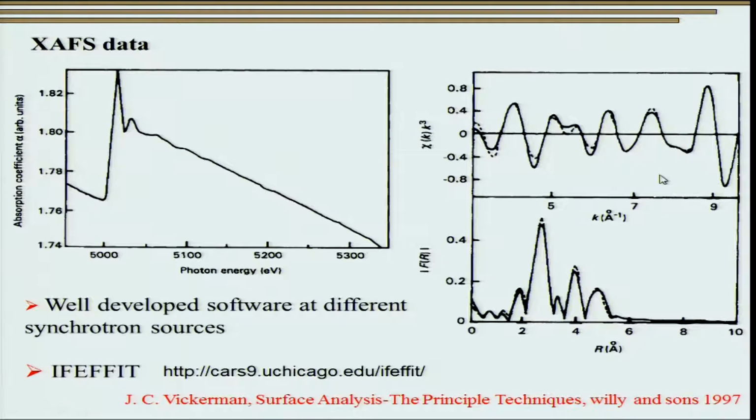Now, another important thing is that this k is essentially in the reciprocal space. So, that is why you see over here we have the angstrom inverse, right. Now, this information can be taken back and plotted in the real space, and we do get this as a function of r, which is nothing but the actual distance between the atoms under consideration, and this shows the intensity, right. So, this is what we are going to try and match when we take the data.